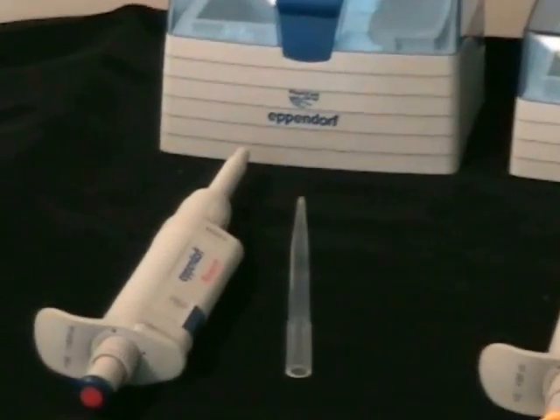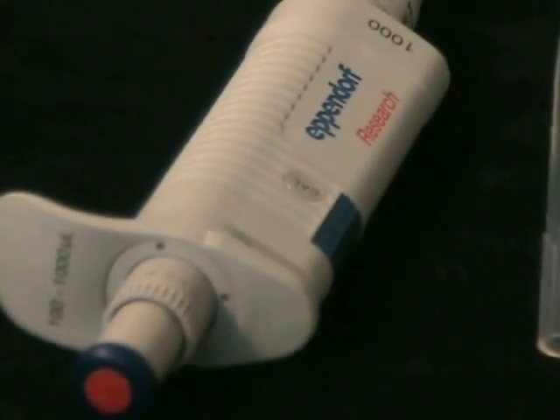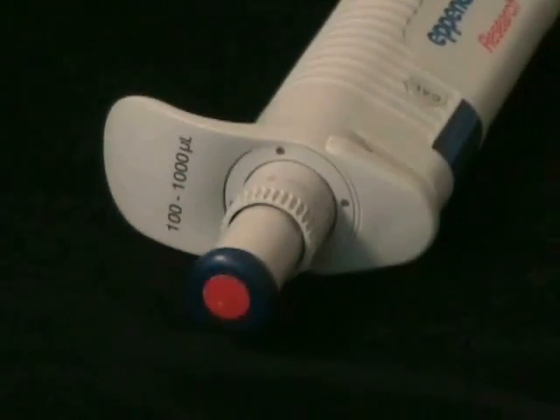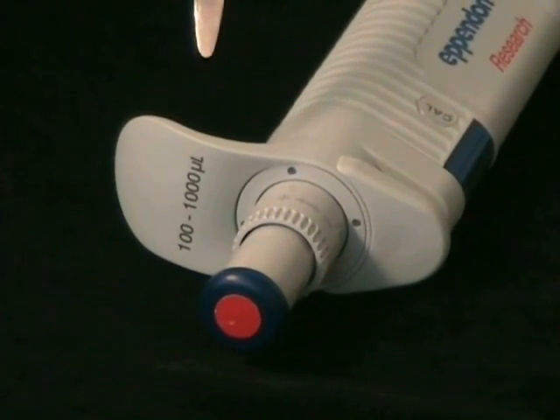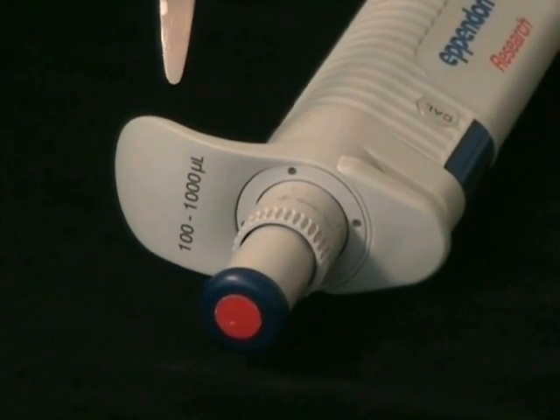On the table we've displayed the main pipettes you'll be using in your course. The first one is a P1000, and at the top you can see the range - it will do from 100 to 1000 microliters.